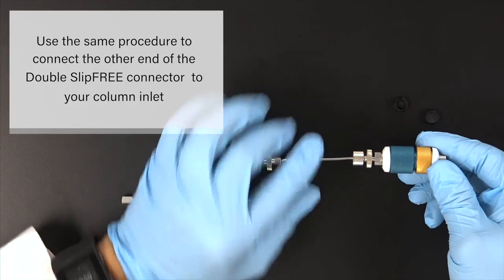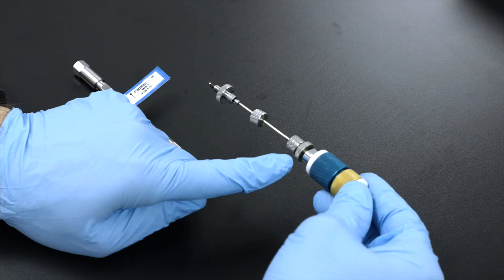Use the same procedure to connect the other end of the double-slip free connector to your column inlet.